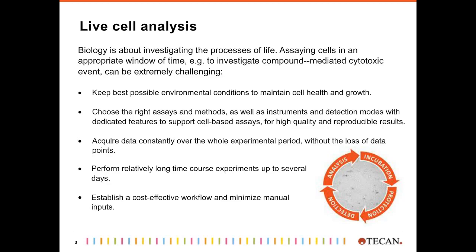You need to choose the right assay and method that allows you to perform real-time and live cell analysis, and those methods should certainly produce high quality and reproducible results.